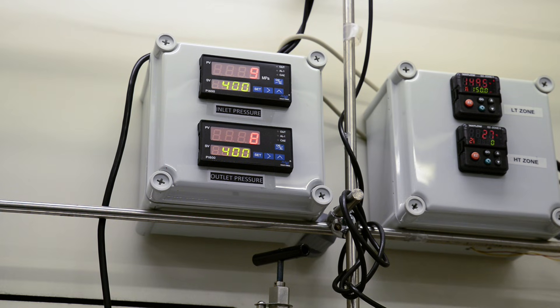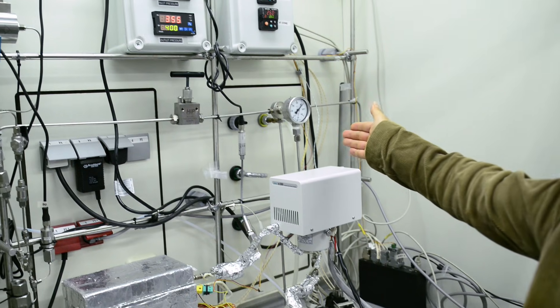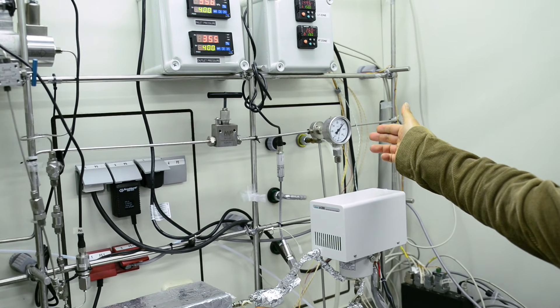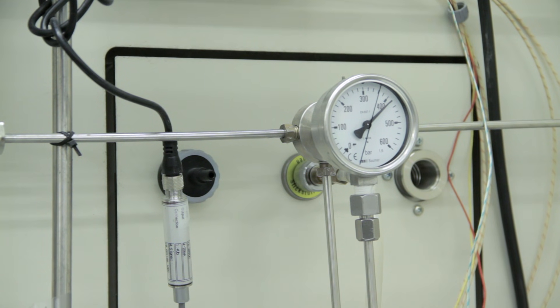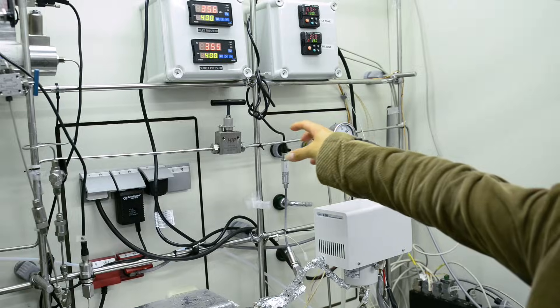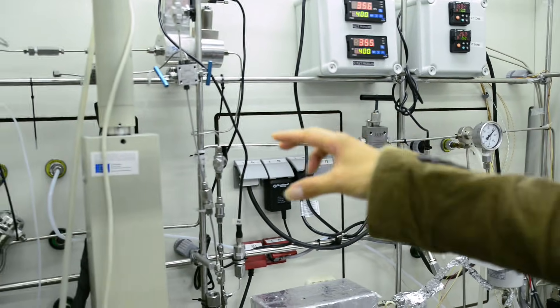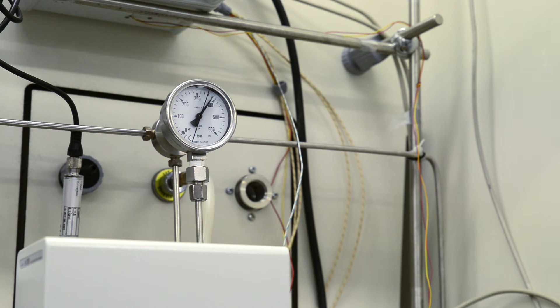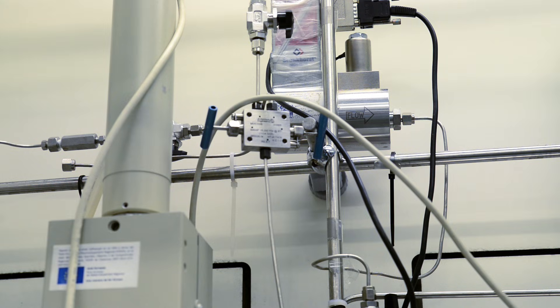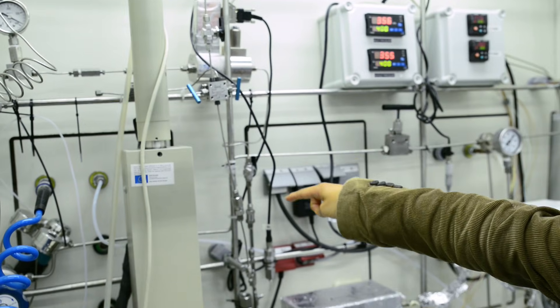In this setup, what we have is high pressure hydrogen, which is coming from here. And we have a hydrogen compressor, and we boost the pressure, as you see here, over 400 bar. And this is going to some tubings for the buffer volume. And then we reduce the pressure using pressure reducers. And then the pressure is reduced, as you see there, a little bit lower than 400 bar. And then going to this mass flow controller, controlling the flow rate of hydrogen, and going into the reactor.